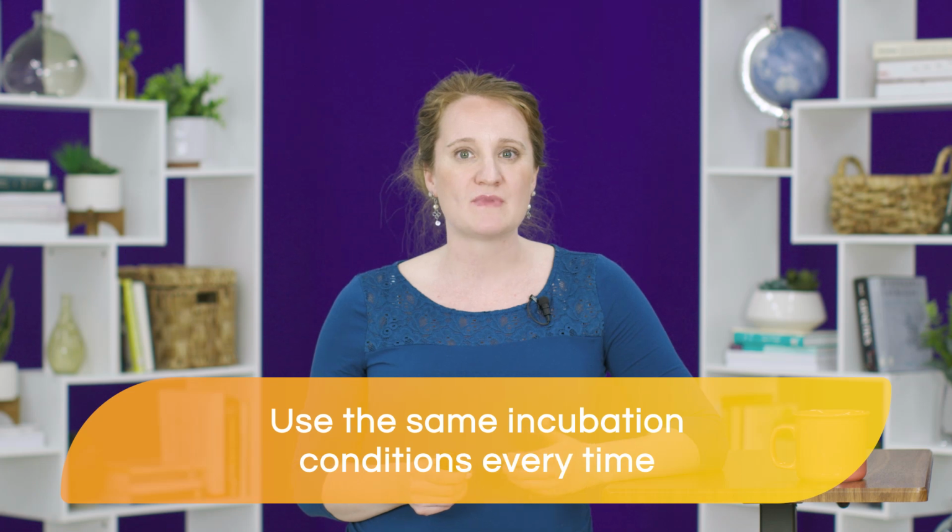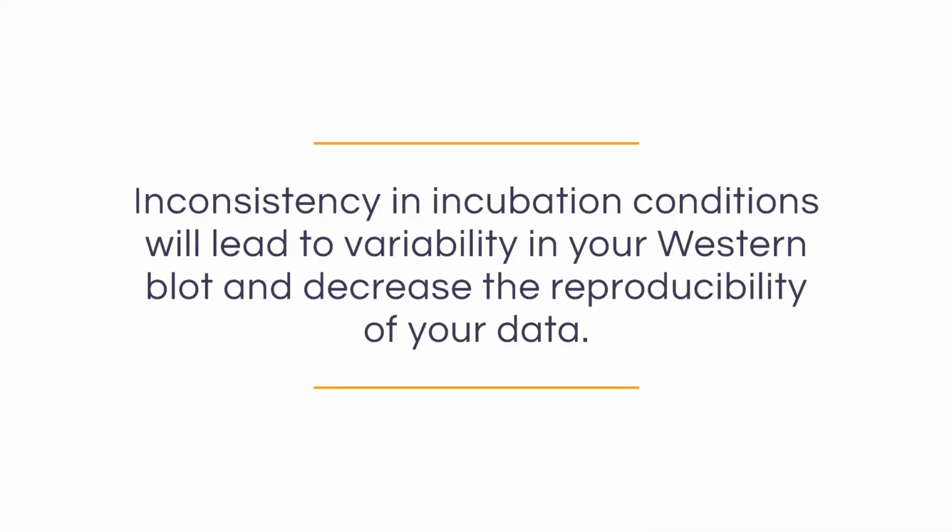You don't want to incubate your membrane for 1 hour at room temperature one time and then overnight the next time. Inconsistency in these incubation conditions will lead to variability in your Western blot and decrease the reproducibility of your data.